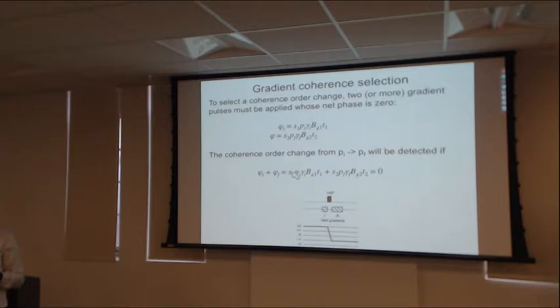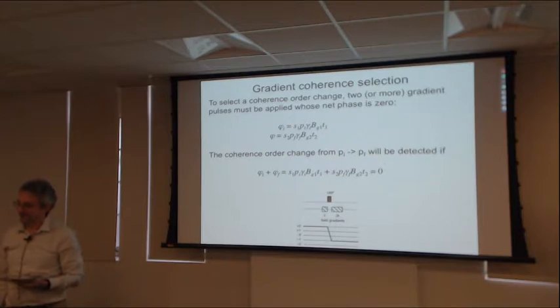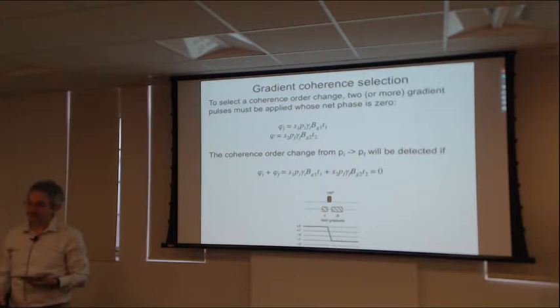And frequently, gradient pulses will be turned on with some shape so that you don't have a very strong transient when you turn on a square pulse. In the old days, it's less of an issue now. In the old days, on a Bruker spectrometer, the gradient coils weren't so mechanically robust, and it was possible to turn on a strong enough square gradient that the transient impulse magnetic field forces would break the gradient coil loose.